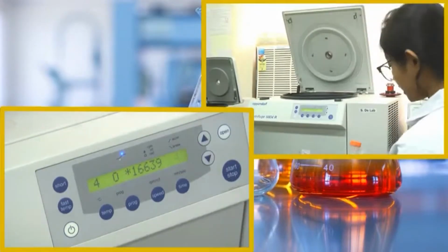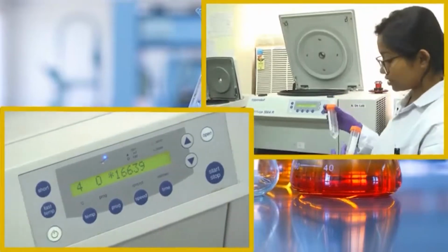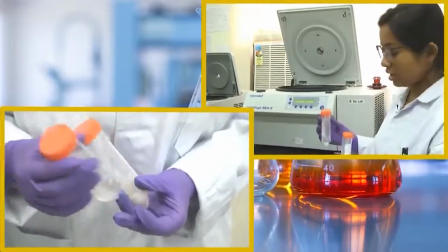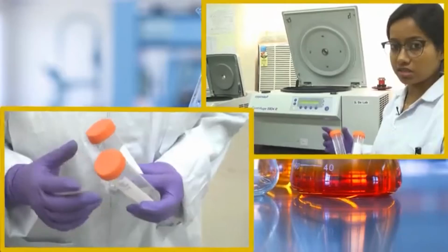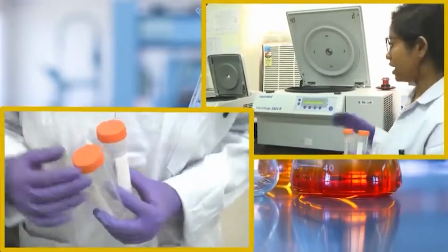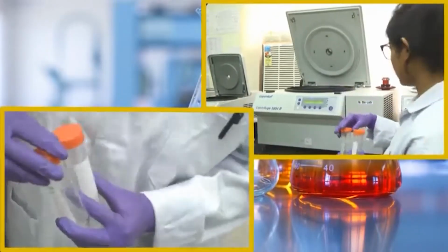Another thing we have to make sure is that we have an equal weight of this solution, because when we go for centrifugation, it is advisable to always have an equal weight on the opposite side. Otherwise, when the centrifugation starts, there will be a weight imbalance and there might be a chance of accident.